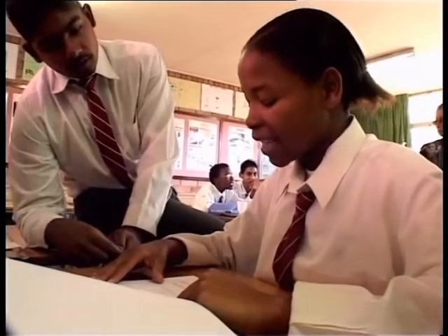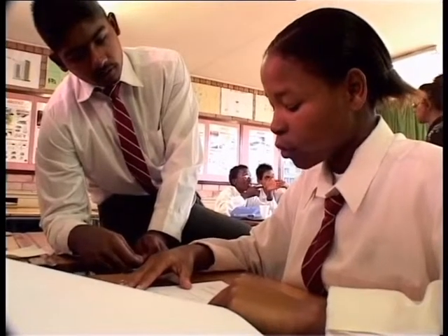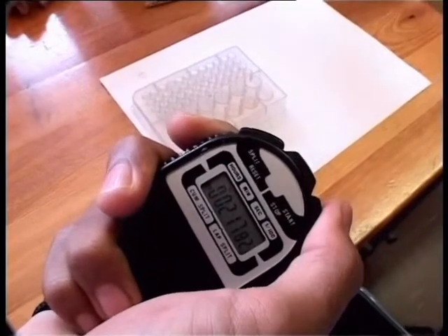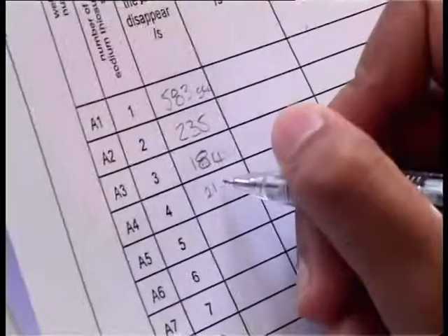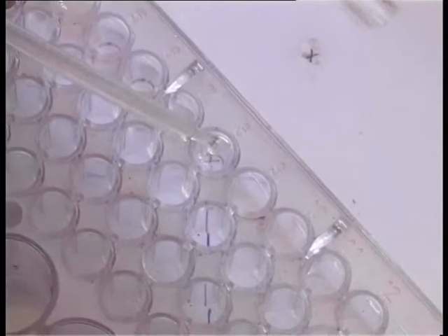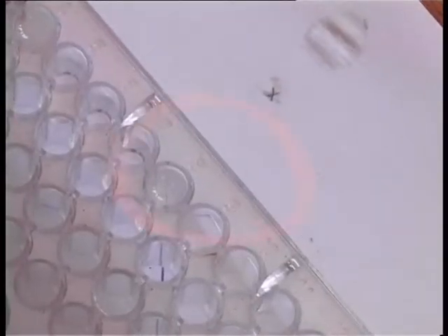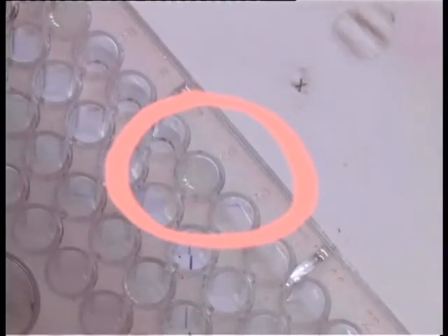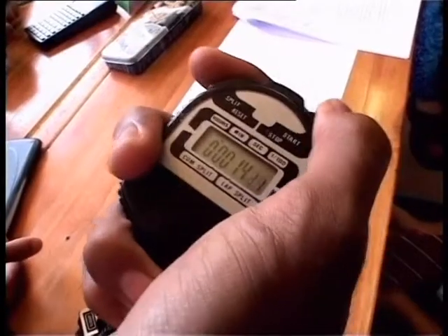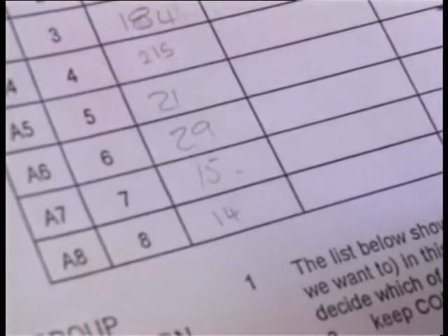Repeat steps 7, 8, and 9 in well A2 to A8. The learners notice that the time taken for each ascending well to turn milky white becomes less and less. In this group, well 8 is timed with the standard 5 drops of hydrochloric acid being added to a solution with a concentration of 8 drops of sodium thiosulfate and no water. The time was 14 seconds. This is compared with the 9 minutes and 43 seconds of the first well.